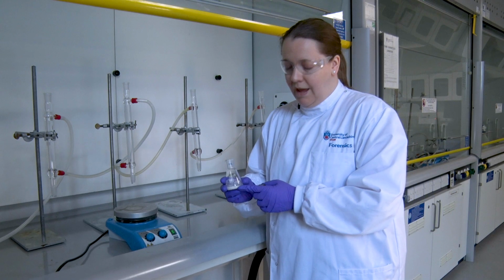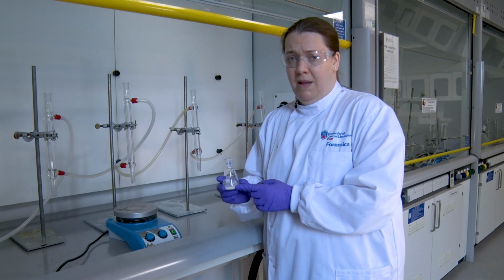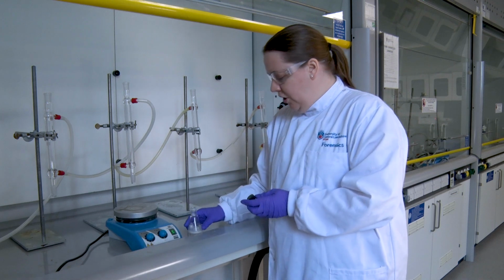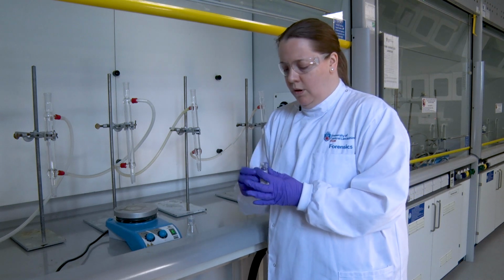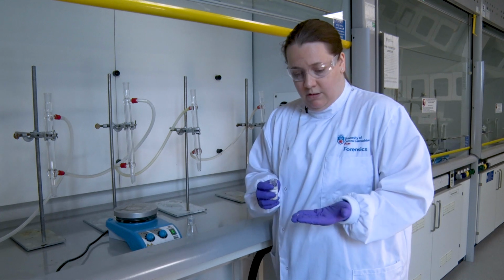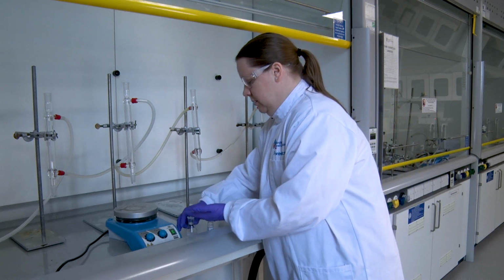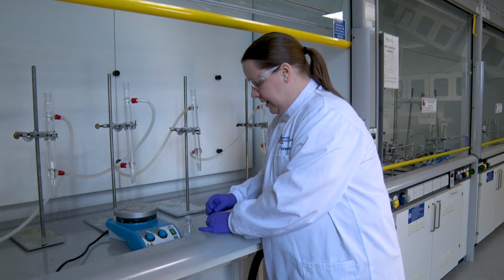So I've got the ethanoic anhydride, the phosphoric acid and the 2-hydroxybenzoic acid in my flask. I'm just going to show you how many anti-bumping granules, because it says to add a few. Because I've got gloves on, you can see it is literally just a few. So I'm just going to pop them in and do the lid up.